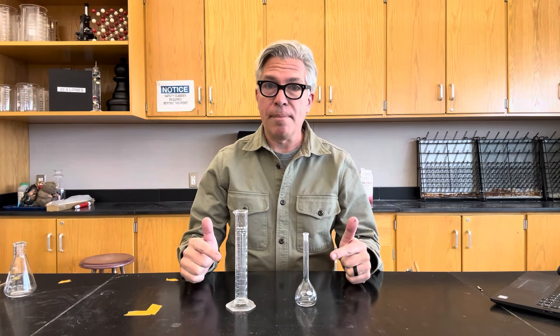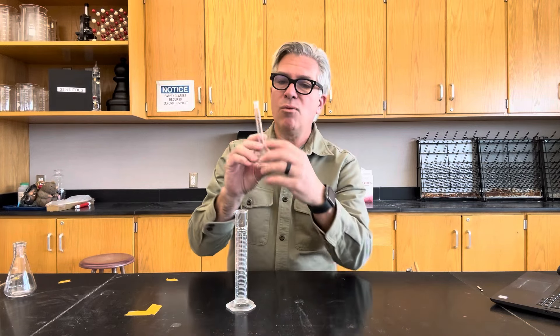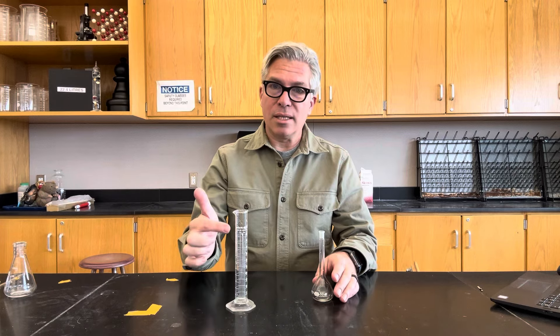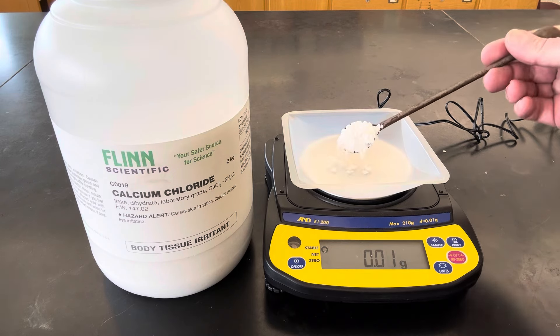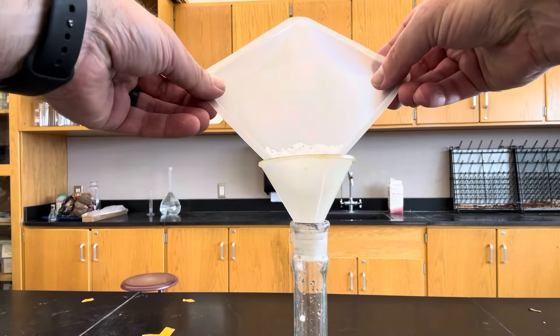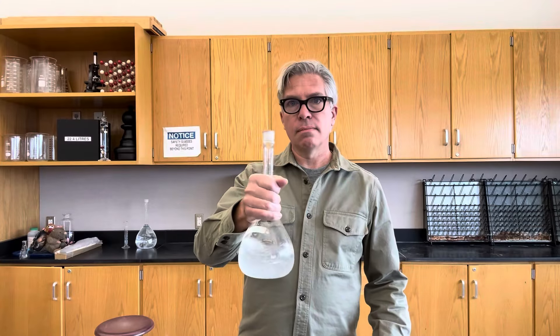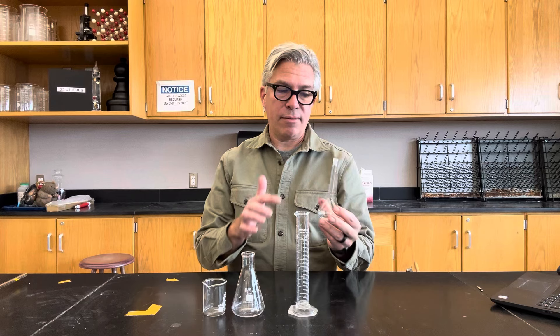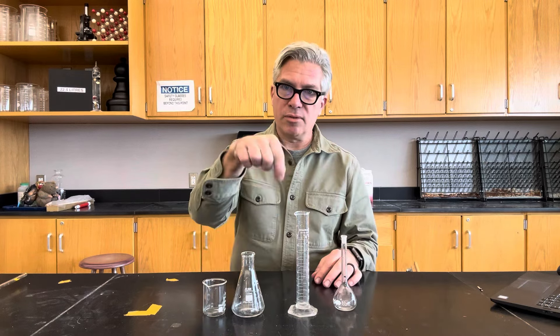On the other hand, if you need your measurements to be more accurate and precise, use a volumetric flask or a graduated cylinder — they both do a really good job. The difference is that the volumetric flask has only one line, so it has one measurement you can use it for. If you need 50 milliliters, that's your best choice. A graduated cylinder has lots of measurements along the way, so you can measure anything less than 50 and get a pretty reasonable result. When making a solution from a solid compound, you calculate and weigh it out, dissolve it in water, and fill it to the mark. The volumetric flask is the best tool for this job. If you need something less than that volume, you may also use a graduated cylinder, although it's a little clunkier for stirring and mixing.